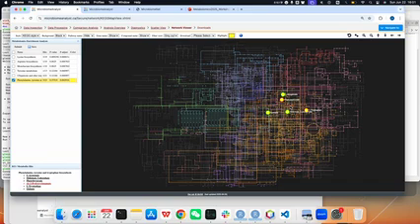This makes it easier to understand the origin of the metabolites and the relationship, because we know why these metabolites change with microbes: microbes may produce them.